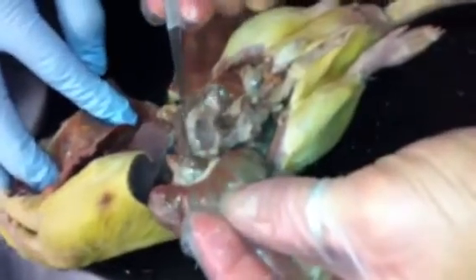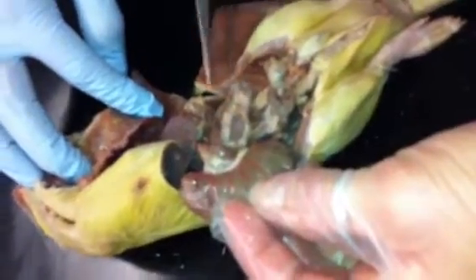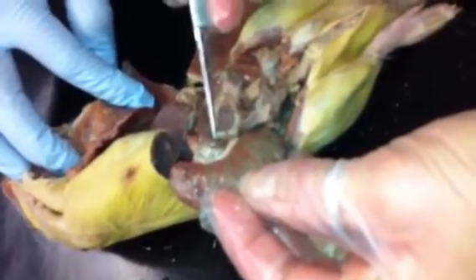And if I move the cecum around, you can tell that's still small intestine if you look at the diameter. It's very narrow. So the small intestine empties undigested food first into the cecum, and then that undigested food is going to pass through the rest of the large intestine as it gets processed into feces.